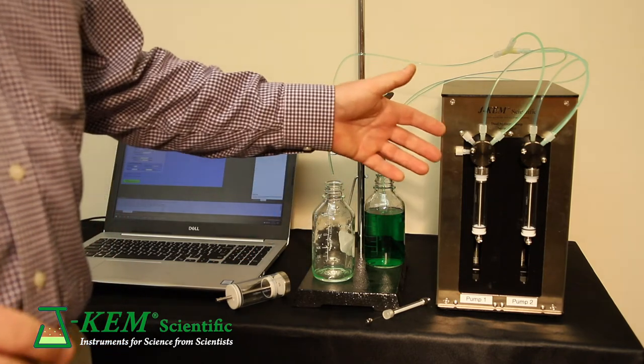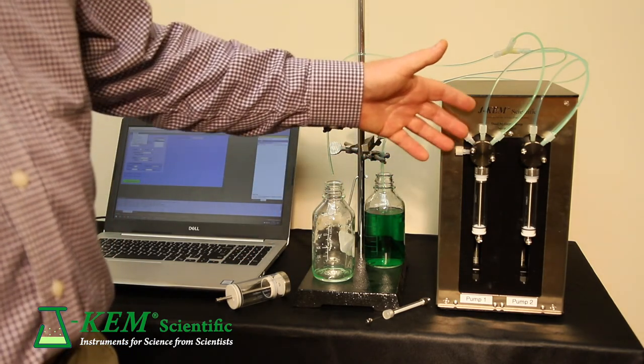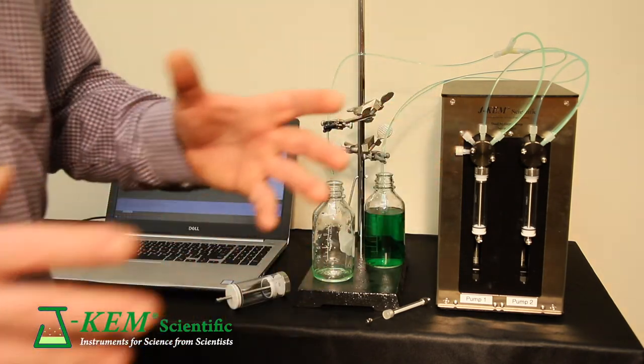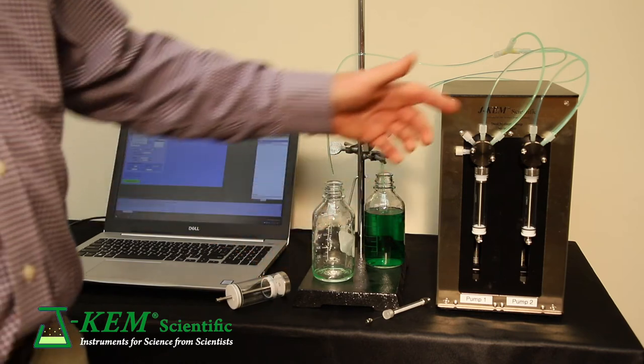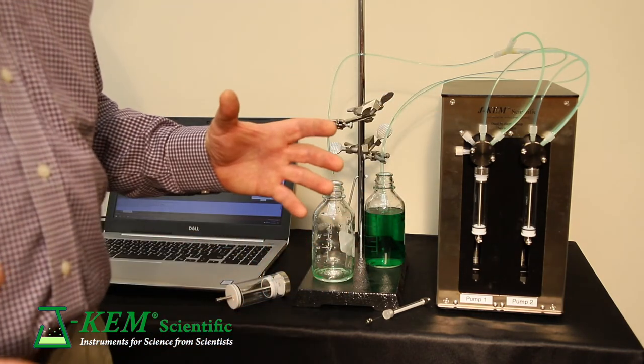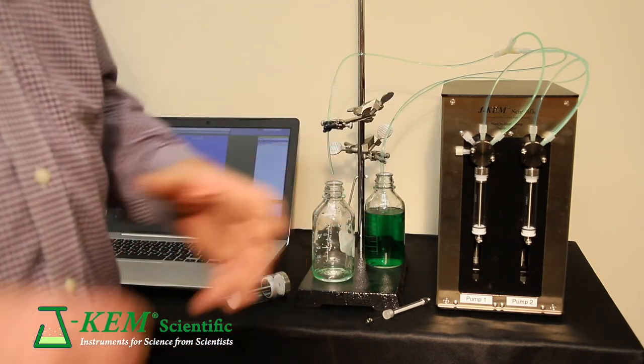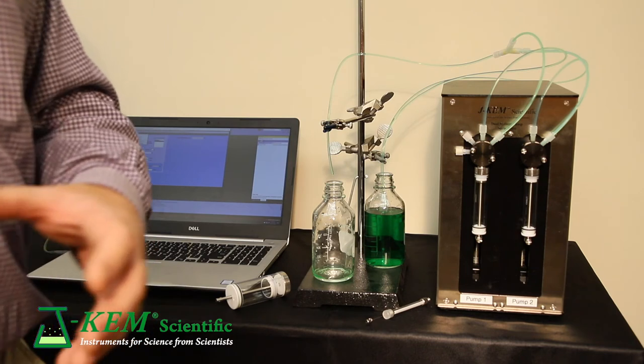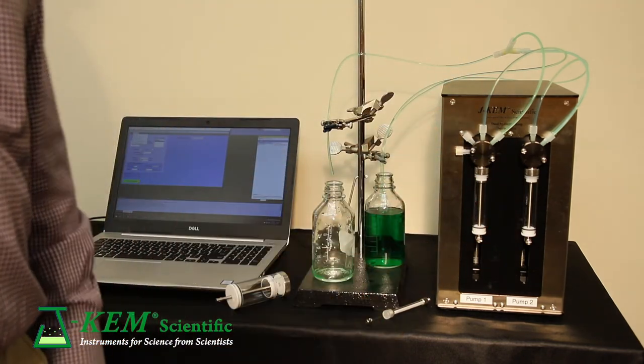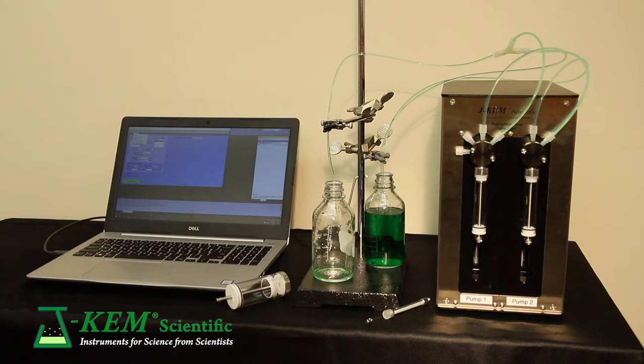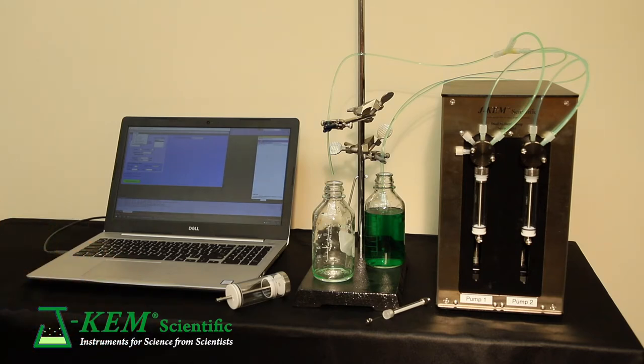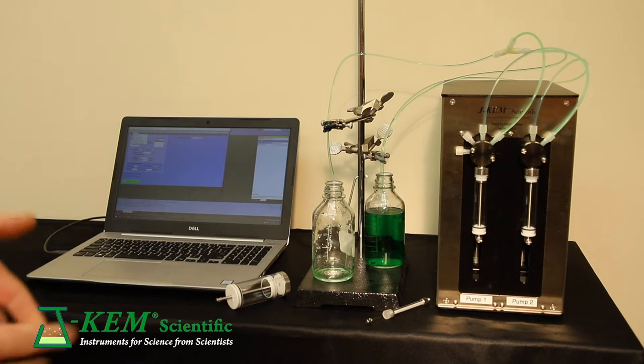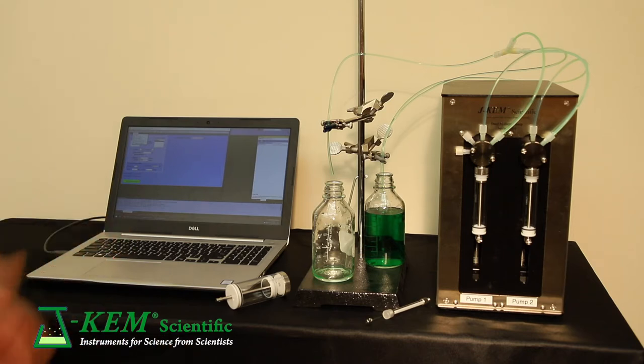So for example, you could have six different reagent bottles and specify six of the ports as inlets and two of the ports as outlets, and have the first outlet going to one of your reactors and the second outlet going to a second reactor. Then under program control, you can say to go to port A and withdraw 25 milliliters of something and add it to my reactor.